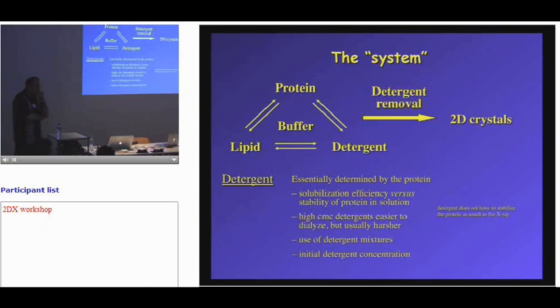You know, it's a race against time. Your protein can sustain high concentration of detergent for a certain while. So when you have a lot of detergent, you take a long time to get rid of it. No, but I think the protein, this is a little bit what you alluded to, starts to change at a high concentration. As you pull the detergent away, the protein is already half dead, and it cannot switch back into its native conformation.